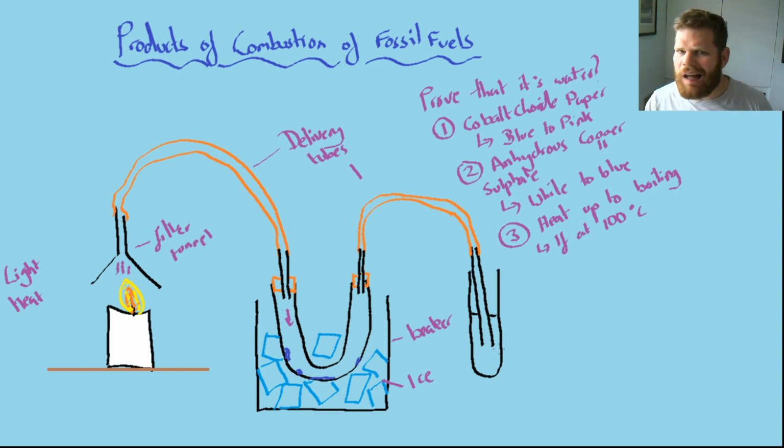Now, what about this last test tube? In this last test tube, we've got another chemical. The chemical in here is lime water. Our gas is going to bubble through that lime water. So what does this mean? Well, lime water is the test for carbon dioxide.